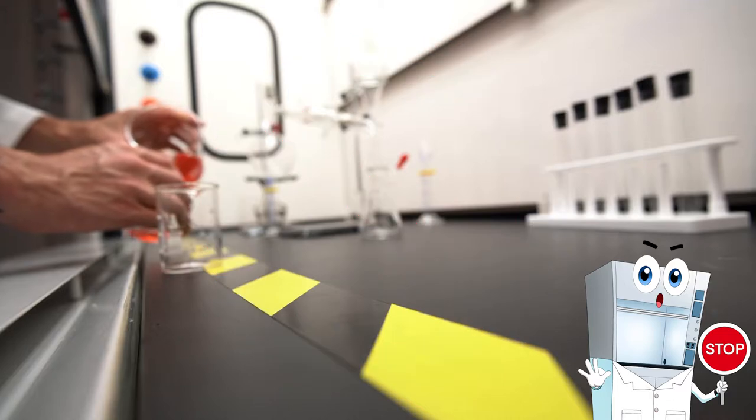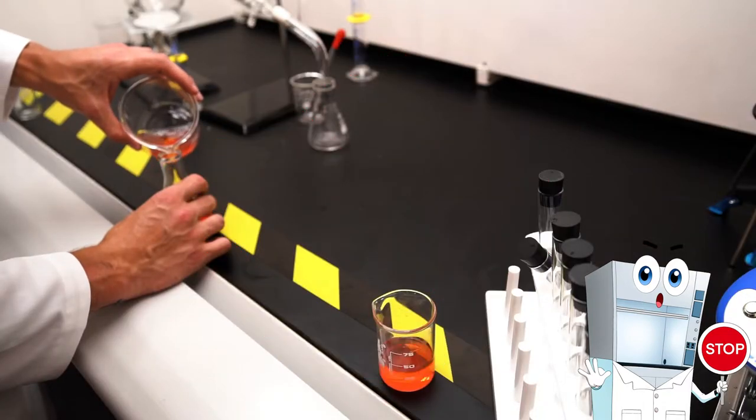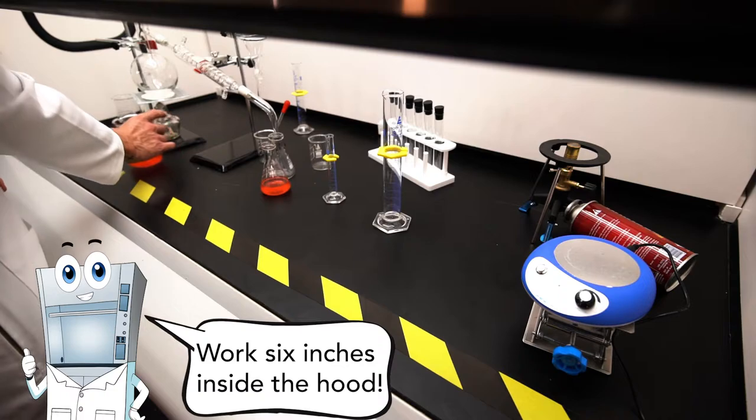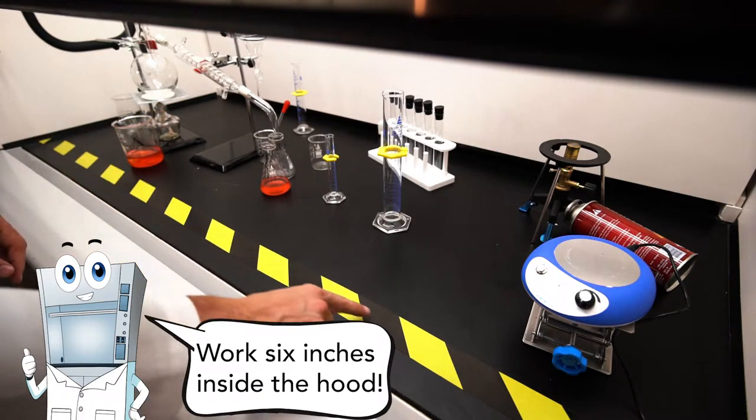Always remember to conduct work 6 inches back from the sash. This keeps fumes being generated away from the sash opening in the user's breathing zone.